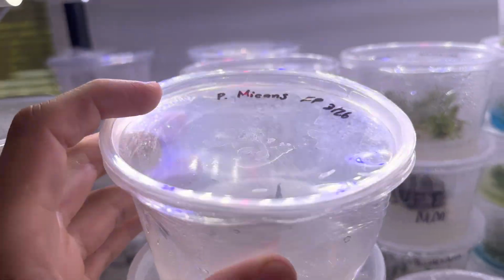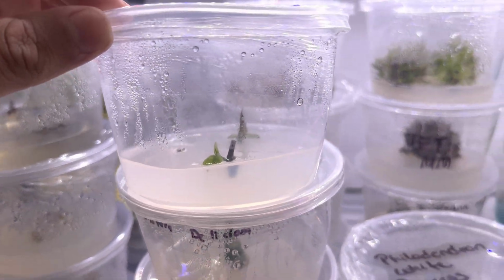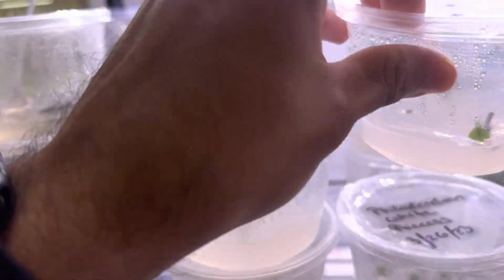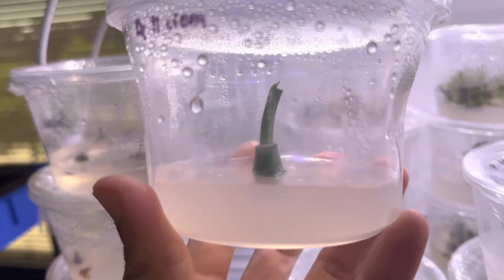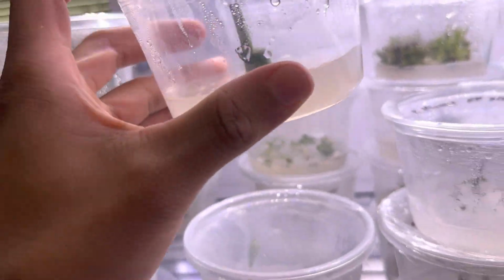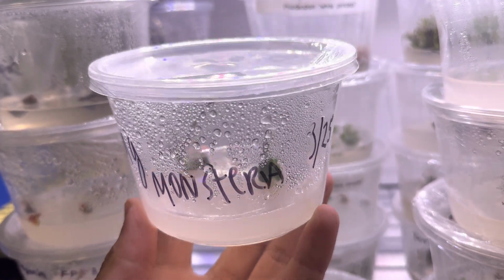This is Philodendron micans. Look at this, no contamination. They're growing fine. This is Monstera deliciosa. Look how great these plants are doing. Look, you see where we cut the plant, and you see that it's growing, and look, there is no contamination at all. This is another plant, another one made by other students.